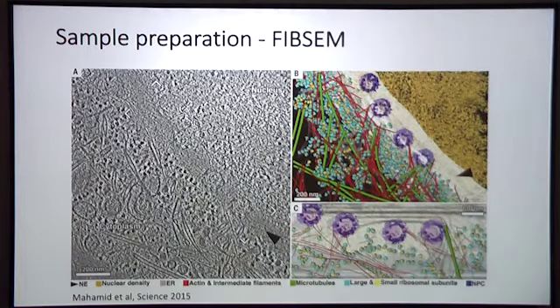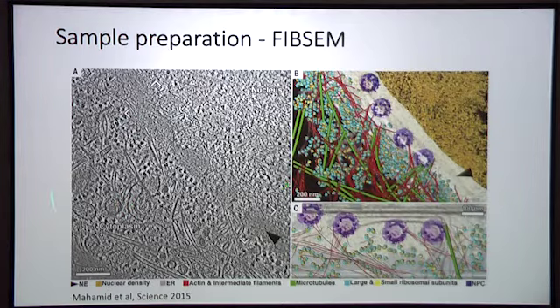It's a beautiful example from the biomolecular department. This is a view of a lamella, and you can see ribosomes and microtubules and all kinds of details. These samples don't have the compression artifacts associated with Cemovis, but this is obviously a complex and challenging method to apply.